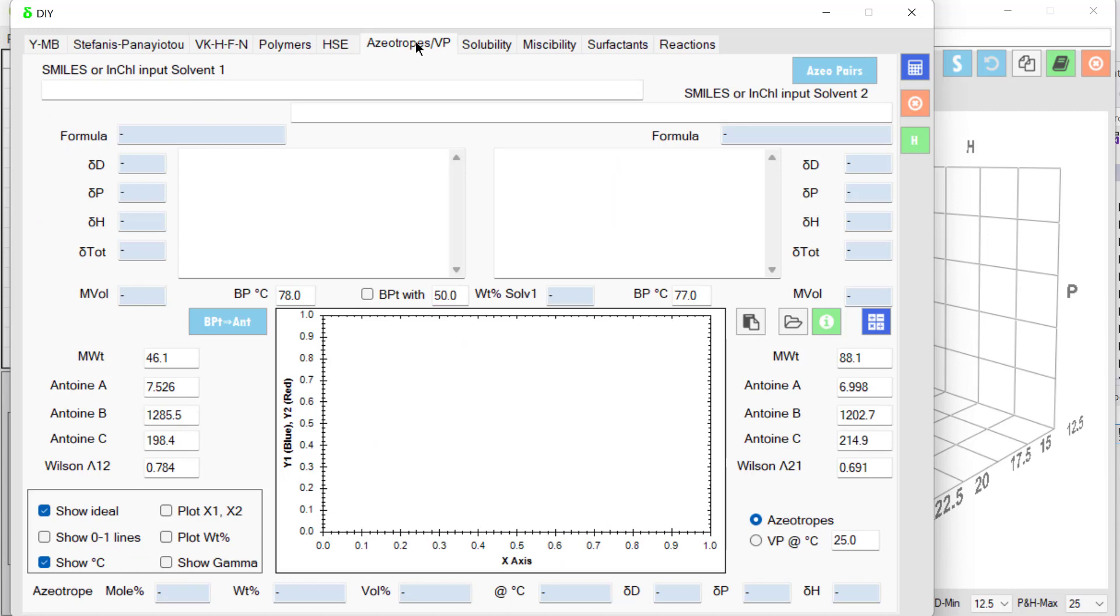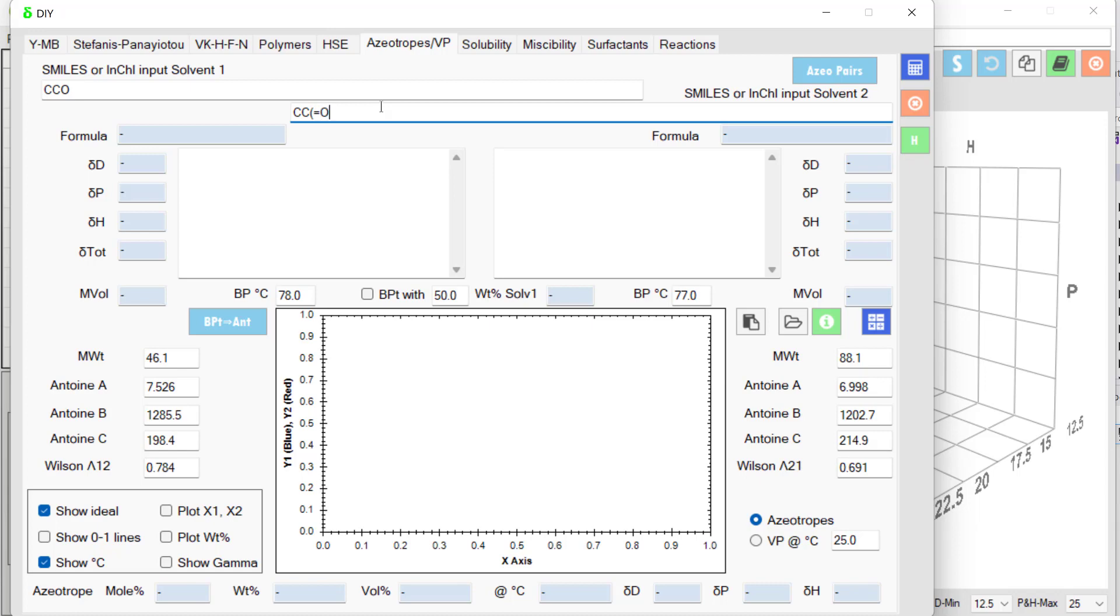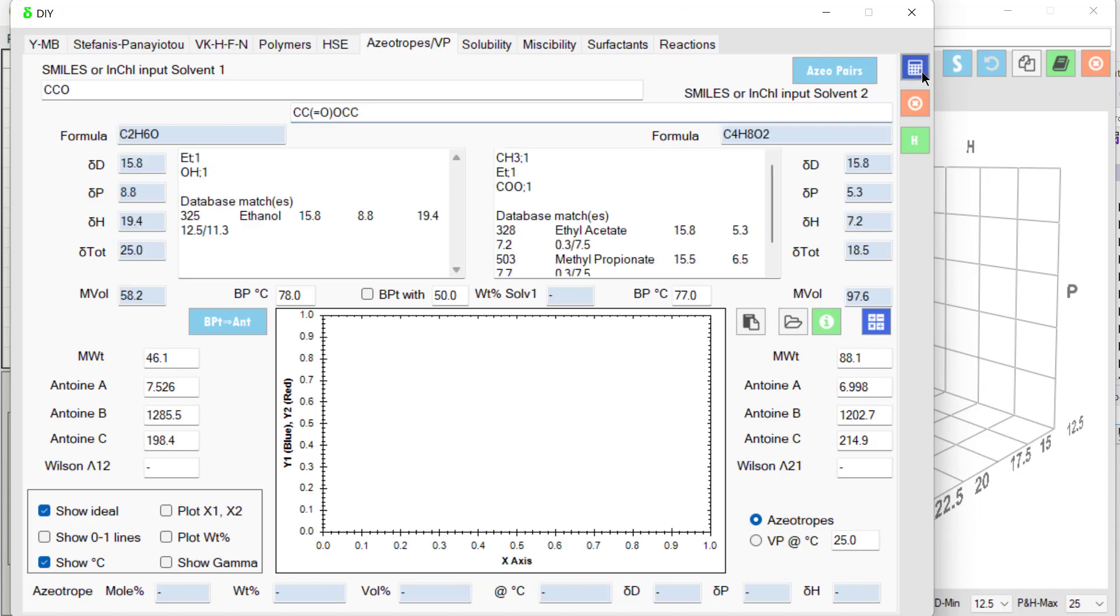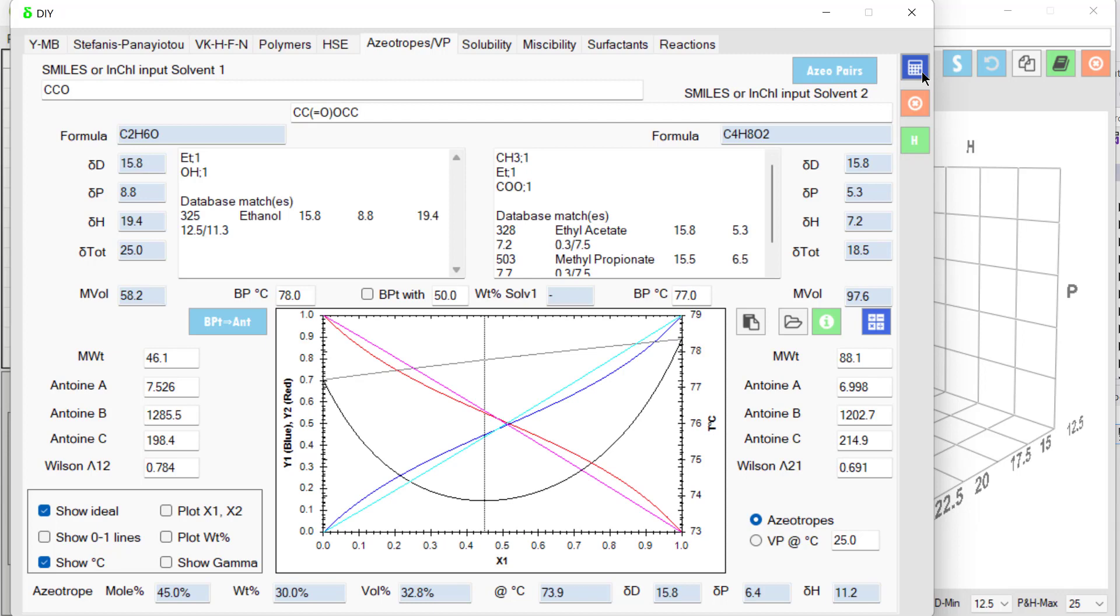Let's talk about azeotropes. Let's try ethanol and ethyl acetate. CC double bond O OCC. See what happens. And we have a complicated plot showing temperatures and mole fractions. But it estimates that there's an azeotrope at 45% mole fraction. So a powerful way of looking at solvent blends.